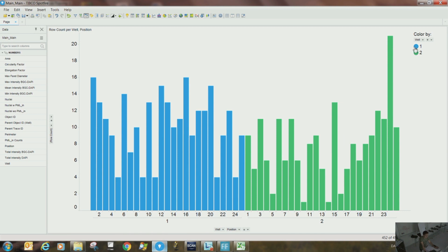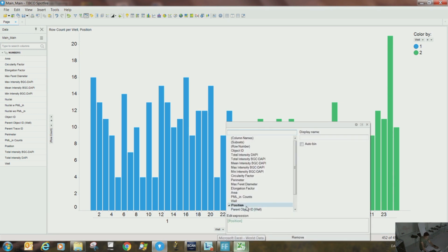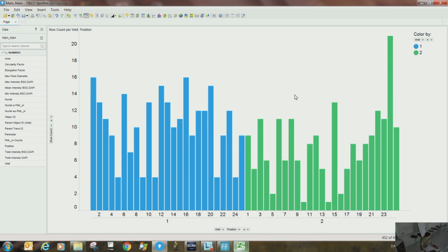So this is all about this one. Let's not do the coloring stuff. I would like to show you how to visualize a bar chart as a histogram. Let's start from that. As you know, in a histogram, the x-axis has the quantity you want to look at.